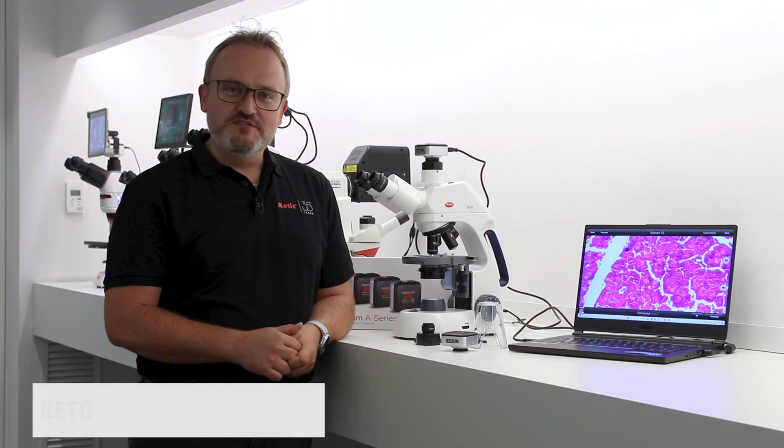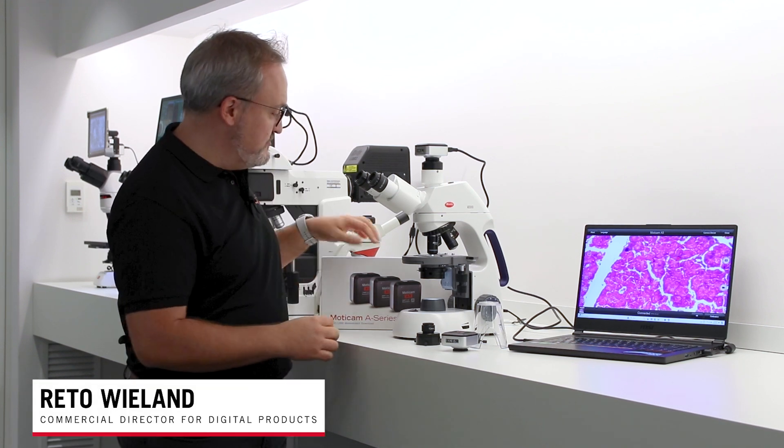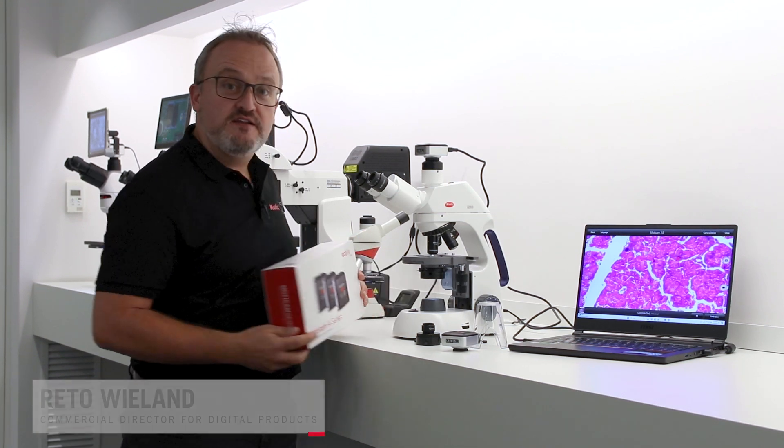Hi and welcome to MOTIC. Now I would like to talk to you a little bit more about the A-Line MOTICAM.